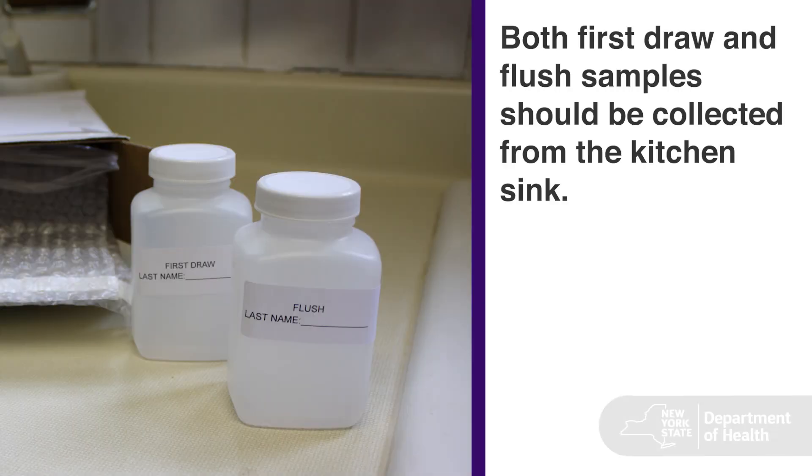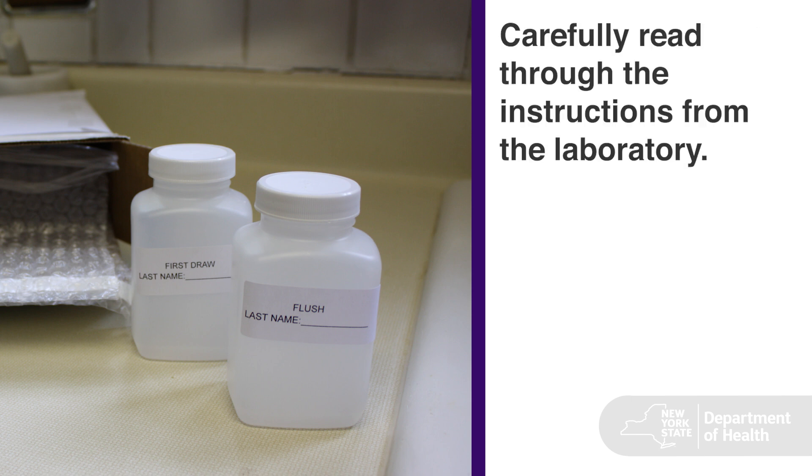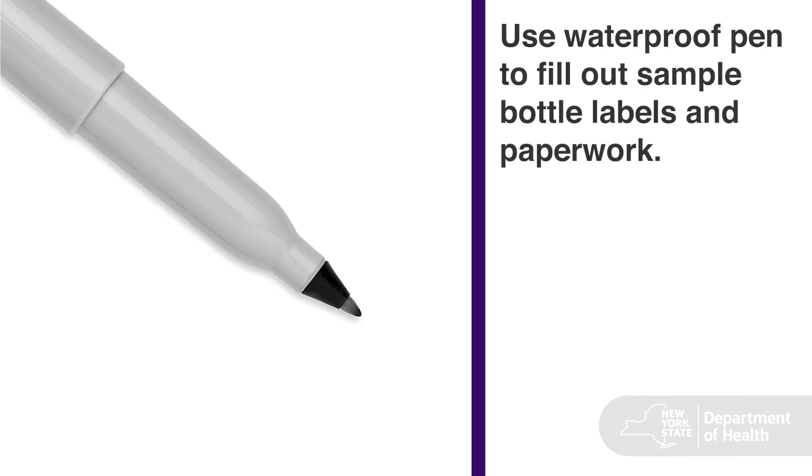Both first draw and flush samples should be collected from the kitchen sink. Open your sample kit and remove all the contents. Carefully read through the instructions from the laboratory. You will need a waterproof pen to fill out sample bottle labels and paperwork.